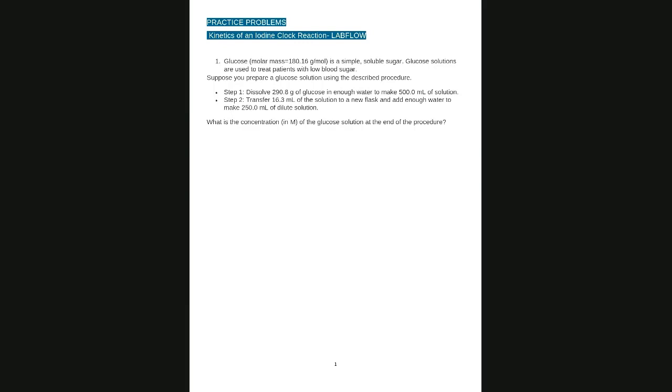It says, Kevin, will we have the same reaction for the lab report as the one in the experiment? Yes. Everybody will have the same reaction that I have, which is an iodine clock reaction. But everyone will have different data.